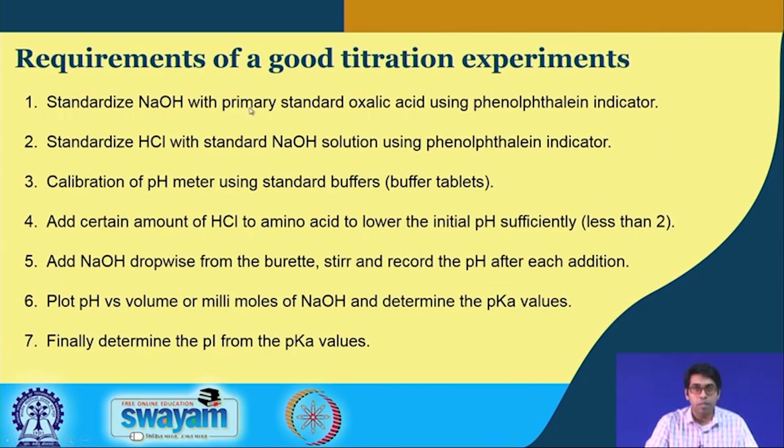Here, this was again discussed in the lab, but I am just summarizing some of the important points. We did not make a standard NaOH solution. We actually made a NaOH solution, and then we titrated it with oxalic acid to determine the strength of the NaOH solution. The reason we cannot make a standard NaOH solution is because sodium hydroxide is very hygroscopic, it absorbs moisture. So, when you take out sodium hydroxide pellets from the bottle where it is stored and weigh it, you do not know how much of that weight is actually sodium hydroxide and how much is moisture.